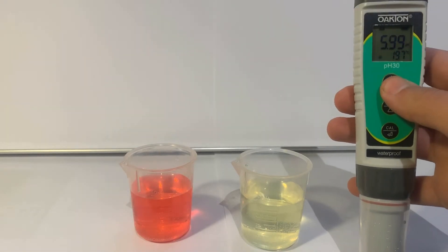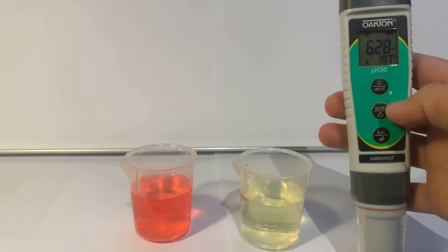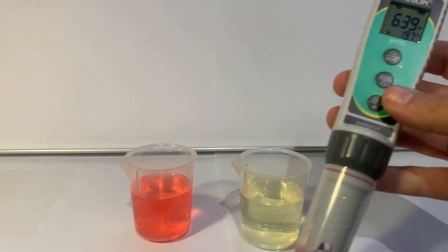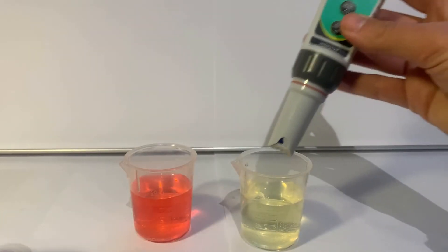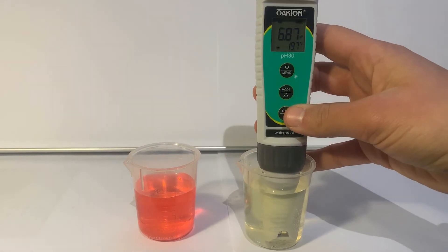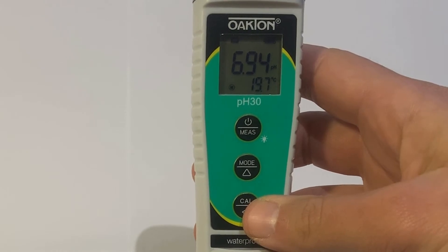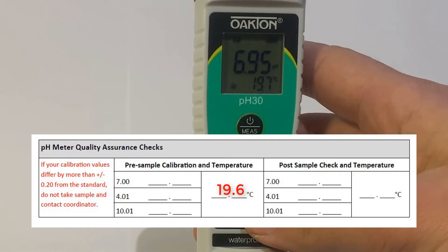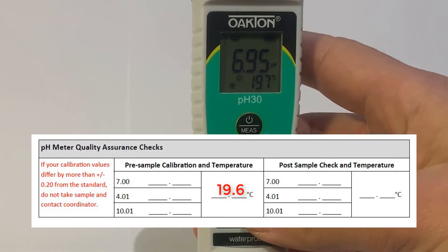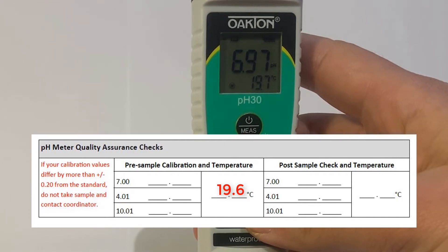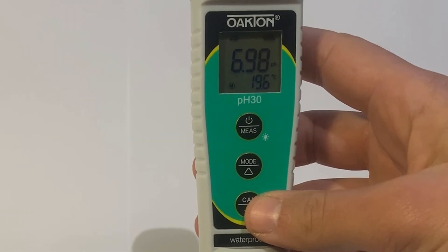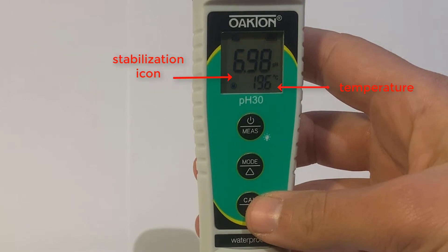Always start with your Buffer 7 solution. Place your meter into the yellow cup and wait for the stabilization icon, which is the small smiley face, to appear. Once it appears record your temperature, which is the bottom number on your datasheet. The top number is what your meter is currently reading. This will most likely be very close to 7, but not exact.